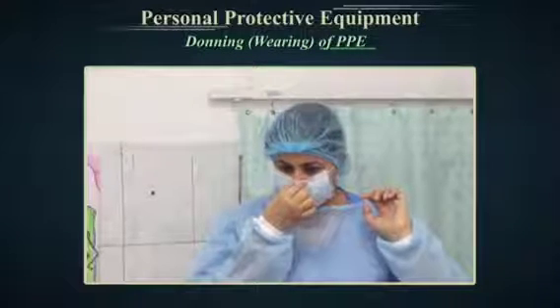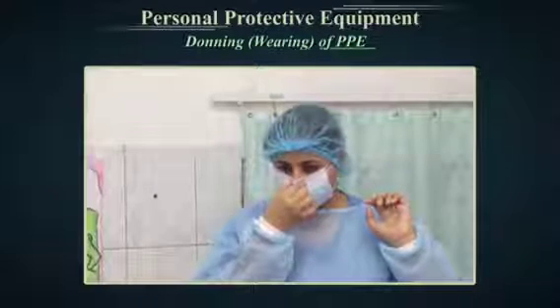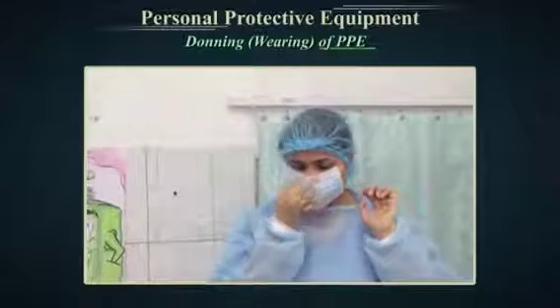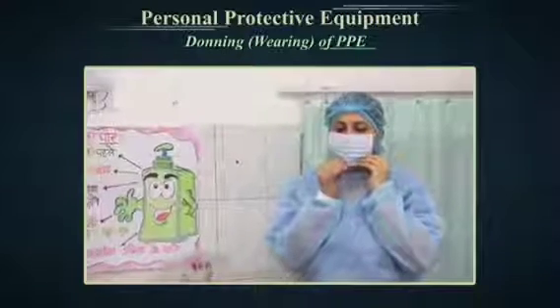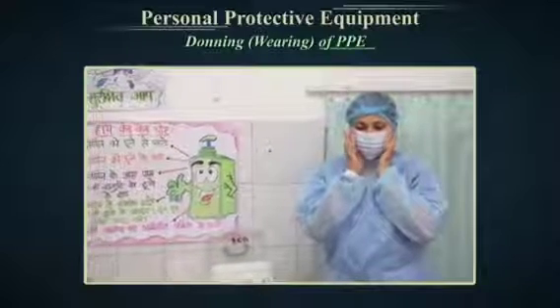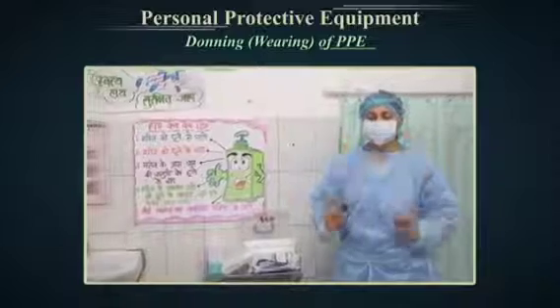To apply this mask, gently crease the metal insert to create an indentation for your nose. Then cuff the elastic bands or tying ends around your ears and spread out the mask across your face from the bridge of the nose to below your chin. Finally, ensure your mask is snug and comfortable over your face.